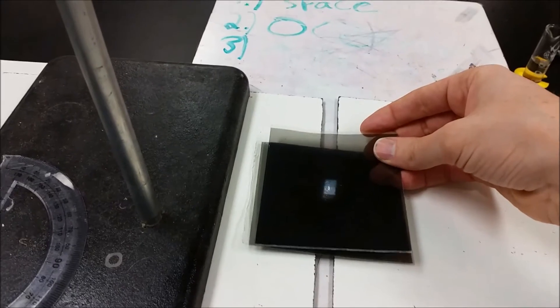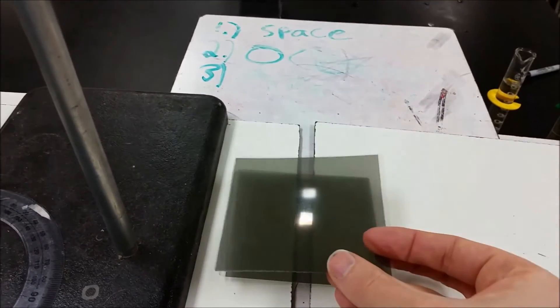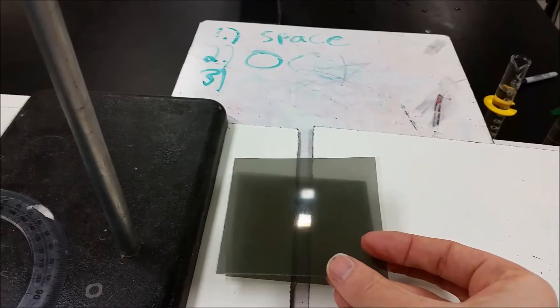So currently, this is at 90 degrees, and you can see there's a minimum of light intensity, and then here's at zero degrees, or 180 degrees.